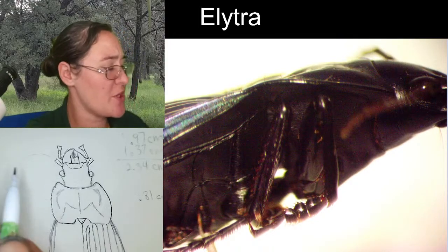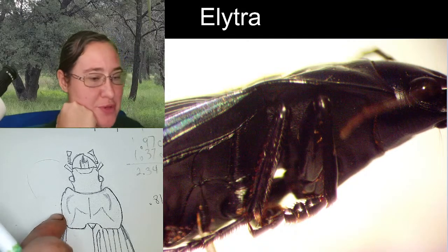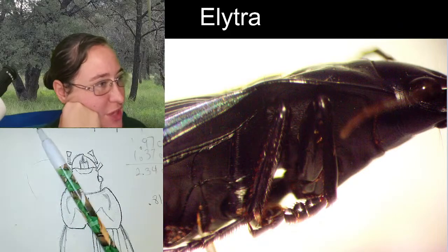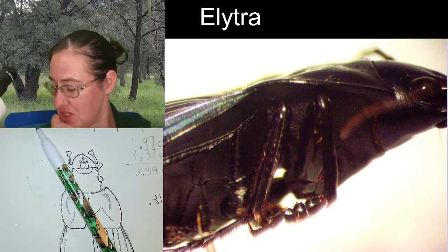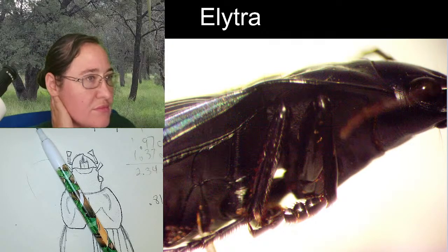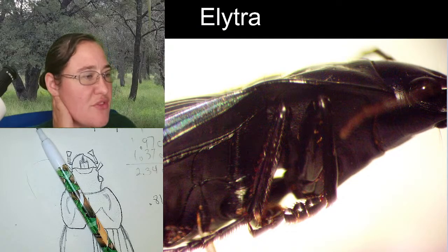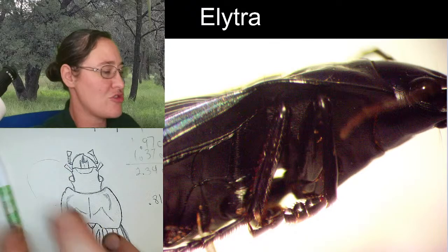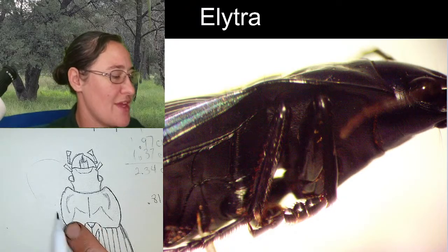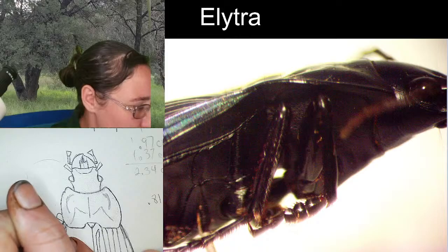So, from this point of view, we can see that the front legs are connected fairly well back on the pronotum here. The femur, from above, you're not going to see much of at all. Pardon me, I'm going to look up 1 or 2 pictures to see while they're walking. Yeah, you're not going to see much of the femur because it's not super incredibly long. They're connected here. They come out like this. So we're just going to give essentially just a little bit of a stump of a femur here.